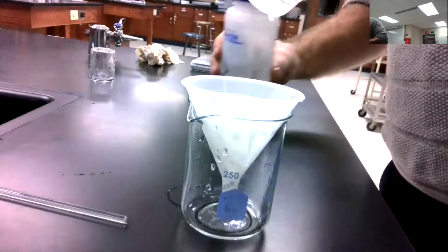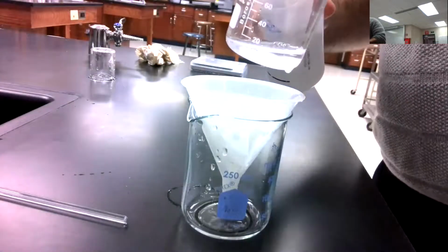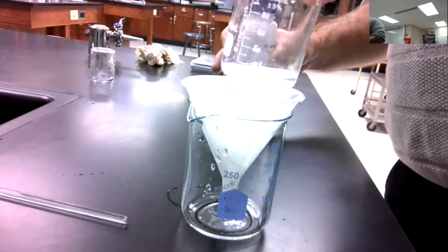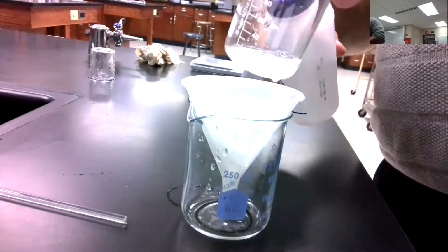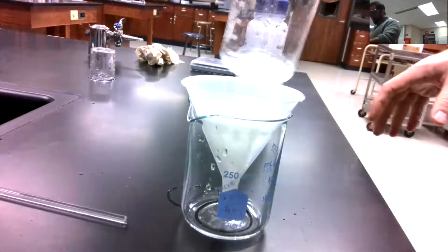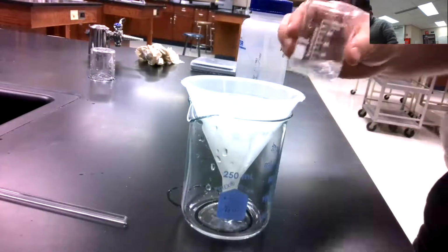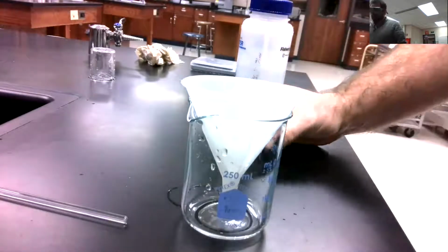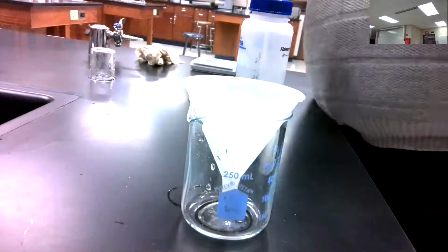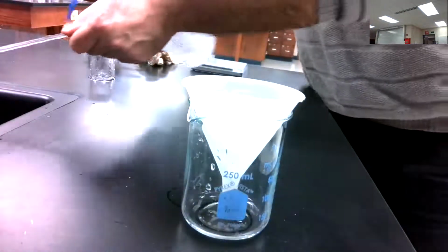Actually, we got some on the side there. It looks like I'll do my best to make sure it drips into the filter there. Set up for tomorrow. Make sure to rinse this off.